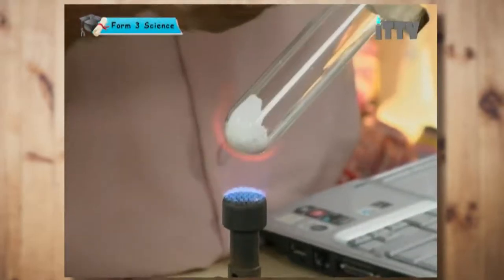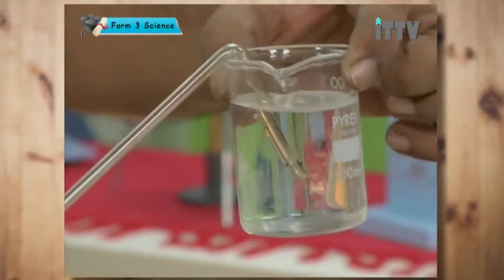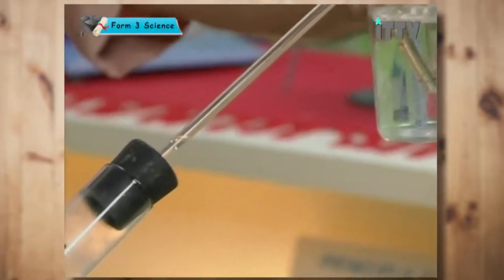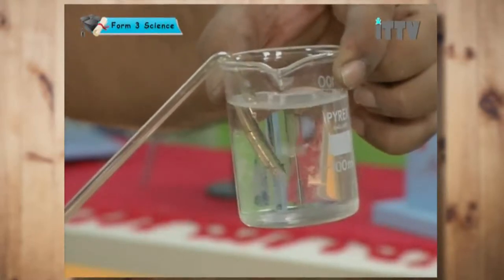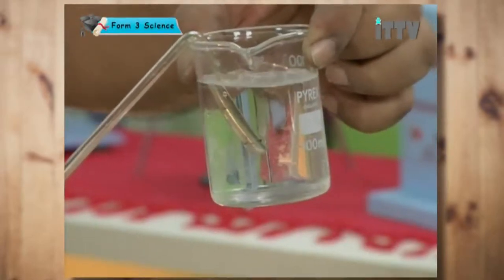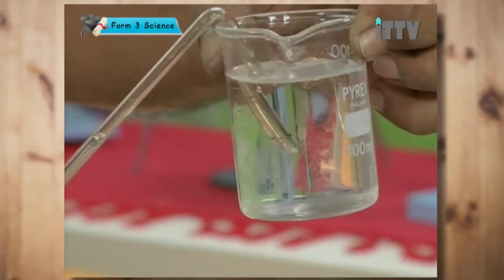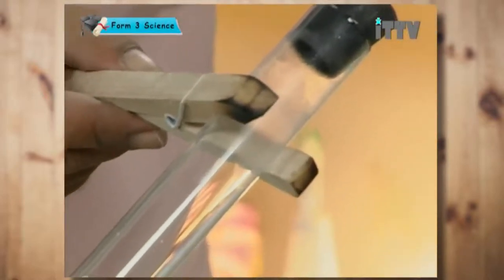So I'm going to deliver this into some... As you can see, we get some gas coming out. Now, this gas is being tested in limewater. Do you all remember what limewater is used for? We use limewater to test for the presence of carbon dioxide. You might notice that inside my limewater I'm getting some white particles floating around, which means that my limewater is slowly changing and becoming a bit cloudy or milky. This would indicate that the gas coming out is carbon dioxide gas.